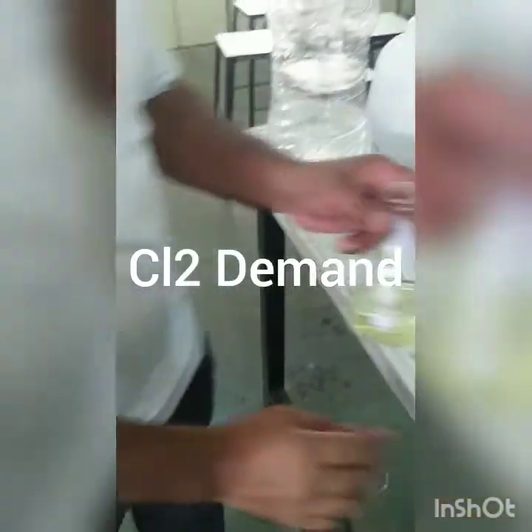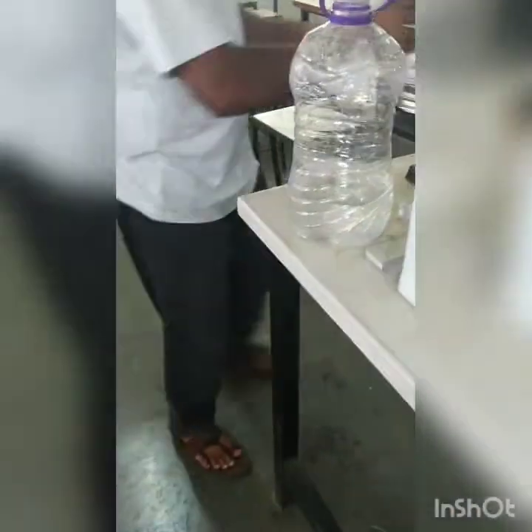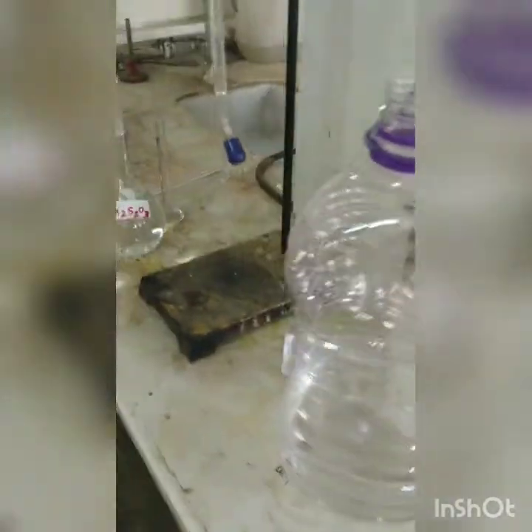Now to this we have to add starch indicator. Again first we have to add 100 ml of distilled water. We have to add 100 ml of distilled water.